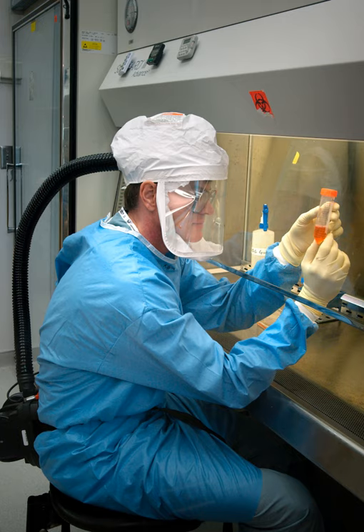In particular, open flames, not necessary within the clean environment of a Class 2 or 3 BSC, cause disruption of the airflow inside. Once work inside a BSC has been completed, it is necessary to decontaminate the surfaces of the BSC as with other lab equipment and materials. When a BSC is serviced or relocated, including replacement of HEPA filters, it must be gas decontaminated. Gas decontamination involves filling the BSC with a poisonous gas, most commonly formaldehyde gas.